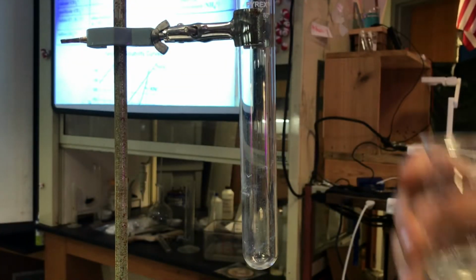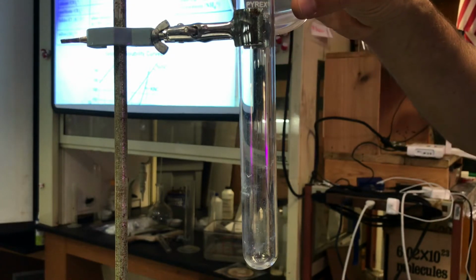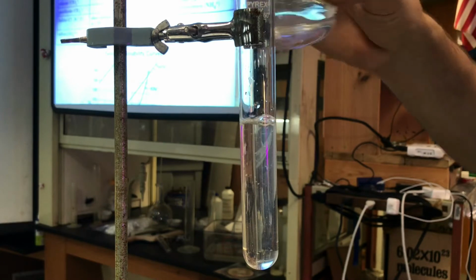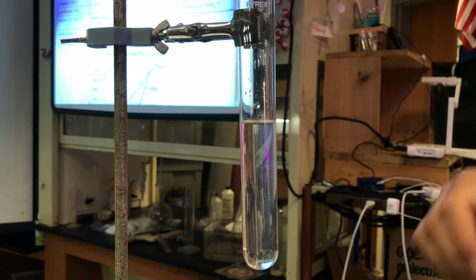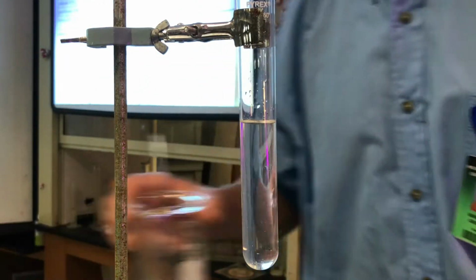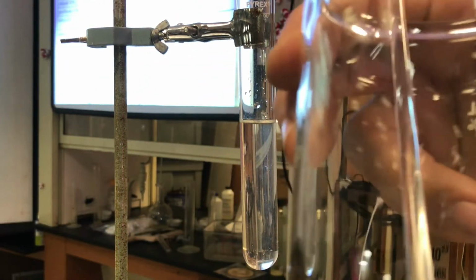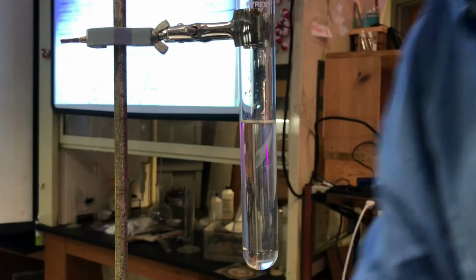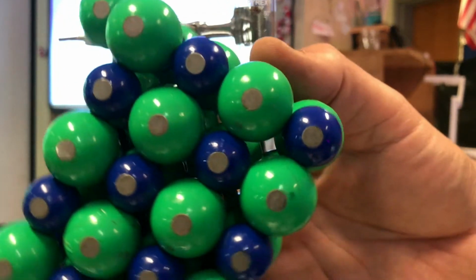Now I'm going to put that in here. And there is my test tube of lead nitrate. All right, I've got a crystal of potassium iodide. There it is, a nice big lump crystal. Light doesn't get through it because the positives and negatives are oriented like this.